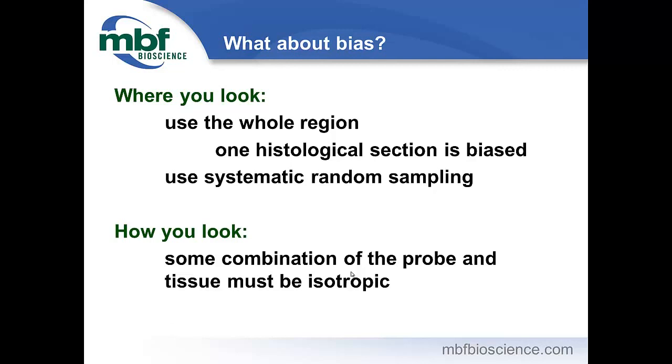So all the probes we've recommended, you're going to want to use systematic random sampling, and that's a big advantage too, because you can get a good snapshot, a good estimate of what's going on by counting surprisingly few events. Mm-hmm. And so that's how you achieve some efficiency for your quantification. And then you obtain this lack of bias by achieving isotropy.